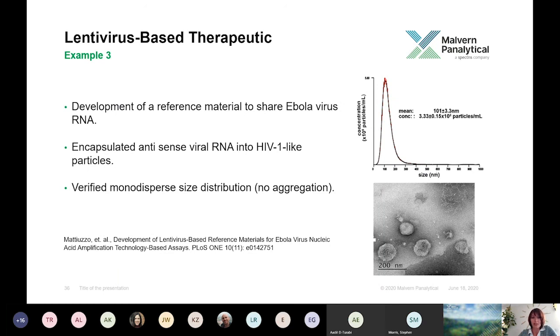Such measurement was really to ensure the sample was stable and free of contaminants. And yeah, as I said, I really wanted to point out the really nice monodispersity of that distribution.